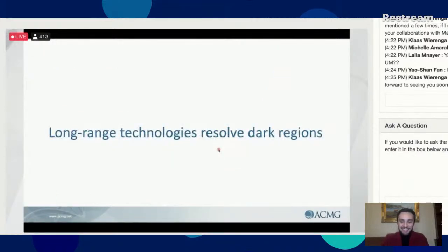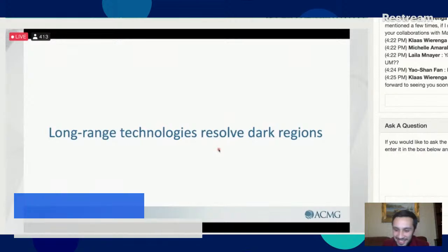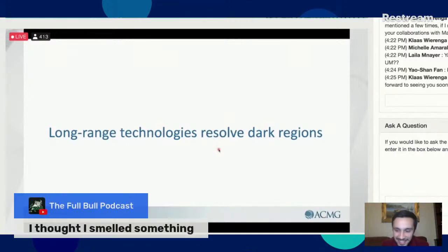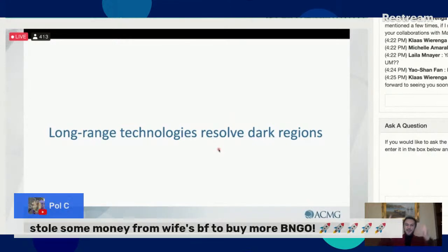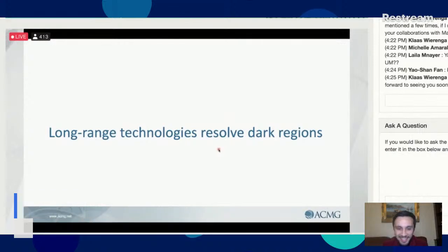So hopefully to this point, I've convinced you that there are a lot of really important genes that are dark, most of them camouflaged, at least portions of them. What we would consider a significant portion, at least 5% of the coding regions, plus a bunch more with intronic regions that are dark. So we're intentionally trying to understate the problem. So the problem is actually bigger than what I've been showing. But what are we going to do about it?